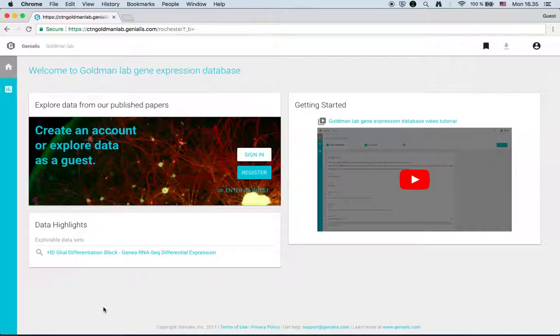Please feel free to create an account, which will allow you to save and share your work. The registration only takes a few minutes. For now, we can proceed as a guest user. We can access the data through either the data highlights or by going directly to interactive visual analysis.